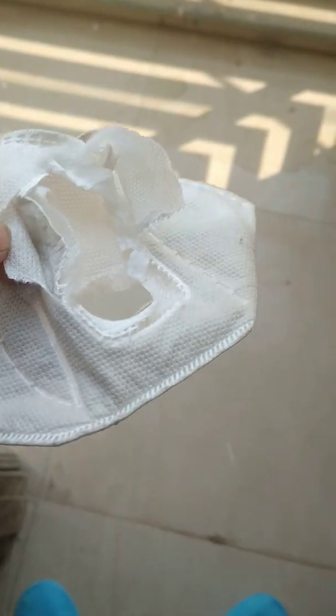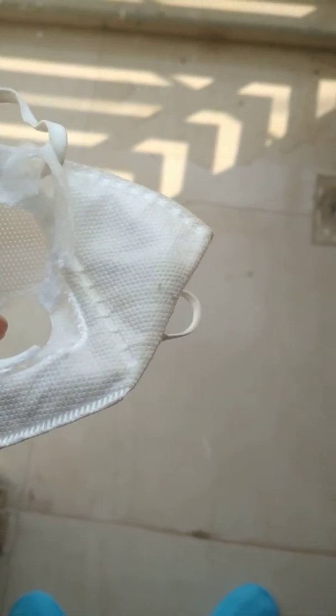When I cut open this mask, you can see that there are three layers. The first outermost layer has larger ports that are visible. Similarly, the innermost layer also has larger ports — so both the outermost and innermost layers have a large filter-like structure with bigger ports.